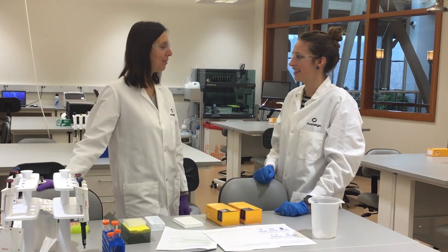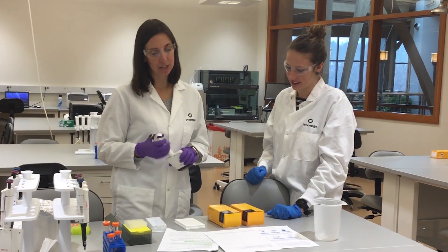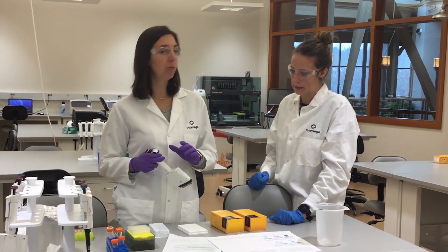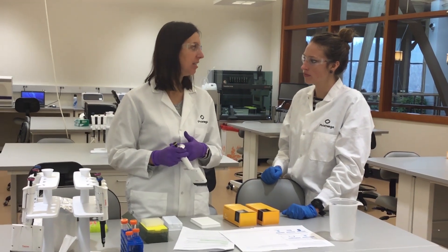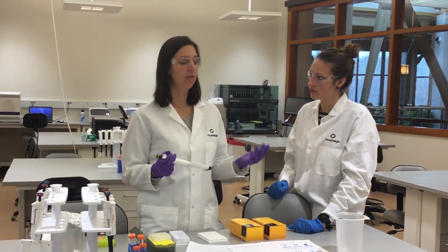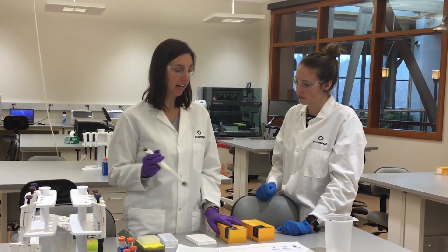Now for the favorite part — we get to see if we got the insertion or not. HiBiT is so much easier to work with than some of the other ones. You don't have to do PCR to analyze if you got an insertion. You don't have to do a full-on western blot. You can just use our HiBiT detection reagent, add it, and go.